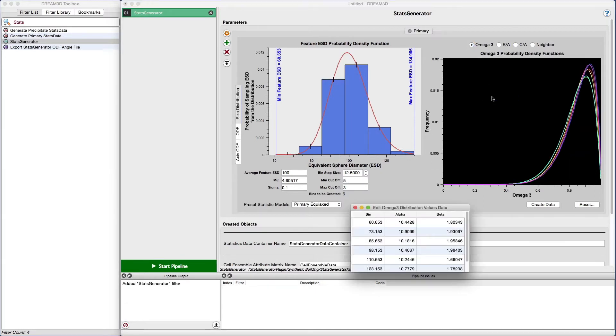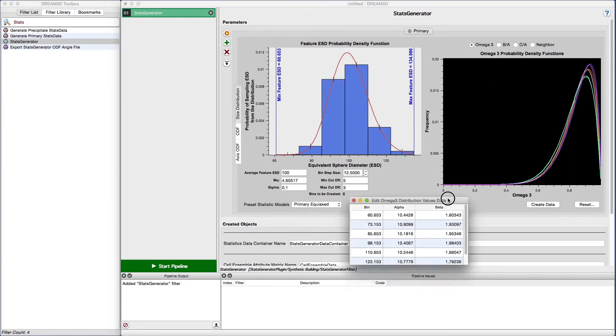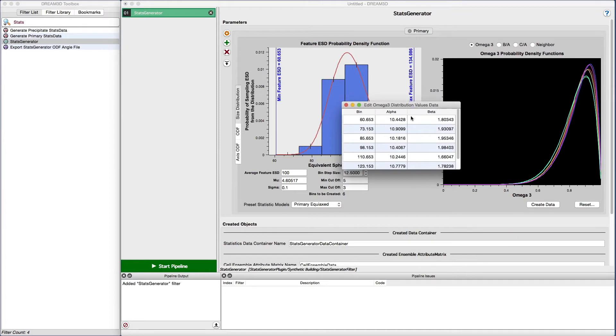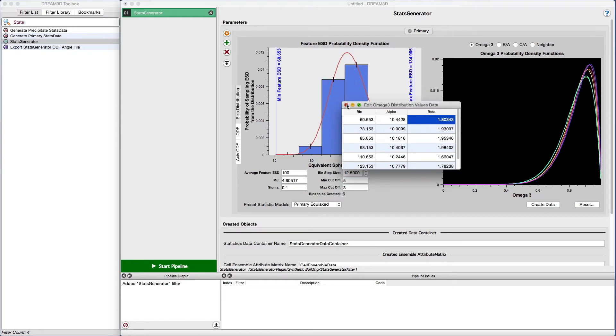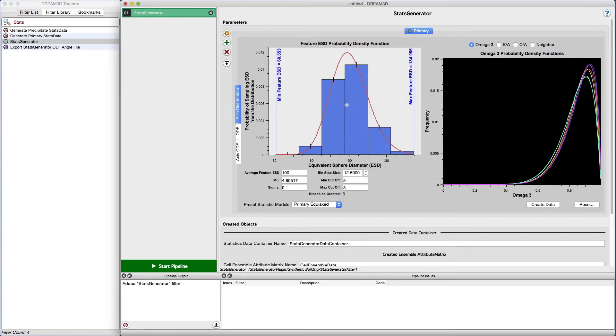If you want to manually adjust any of the distributions, you can right click anywhere on the plot and select edit data. This will present you with a small spreadsheet style input where you can adjust your values. Note that once you do this, you cannot go back and adjust anything on the feature size distribution area.